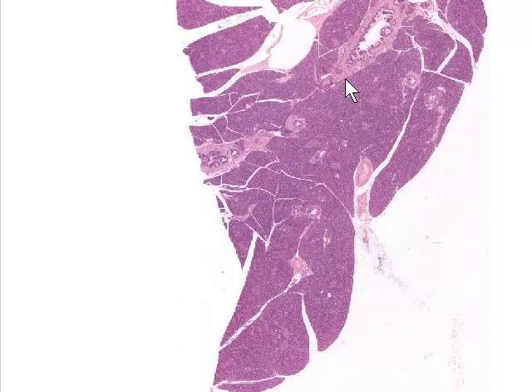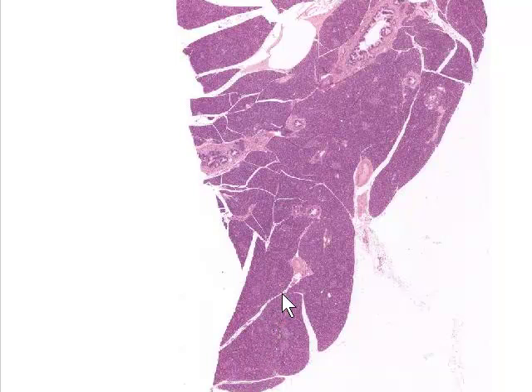Here's a section of pancreas. The first thing you may notice is that the section appears to be fractured or broken up into parts or lobules. There would be connective tissue in here, and this tends to separate during the course of tissue preparation. So the pancreas is in fact divided up into lobules.